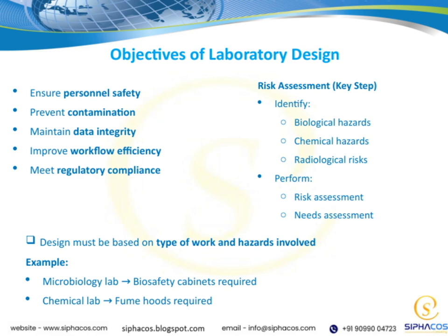The overarching goals of laboratory design are centered around safety, contamination prevention, and data integrity. We want to ensure that personnel are protected at all times, that samples and data remain uncontaminated, and that the workflow is efficient and logical. Finally, meeting regulatory compliance is a fundamental part of the design process. By aligning with all relevant standards and regulations, we not only ensure safety, but also maintain credibility and legal adherence in our work.